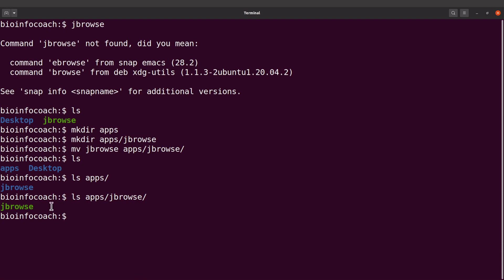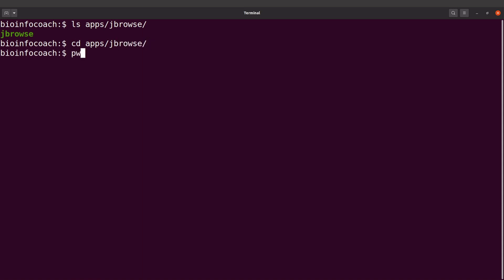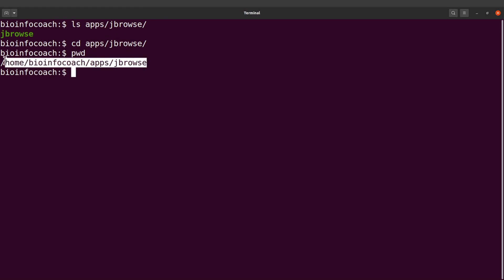Now I need to get the path to this file. There are a couple of ways to do it, but because some viewers may be beginners I'll use a simple approach. I'll cd into apps/jbrowse and then type pwd to get the path. Copy that path — what's displayed for you may be different, so take note of whatever is given to you.